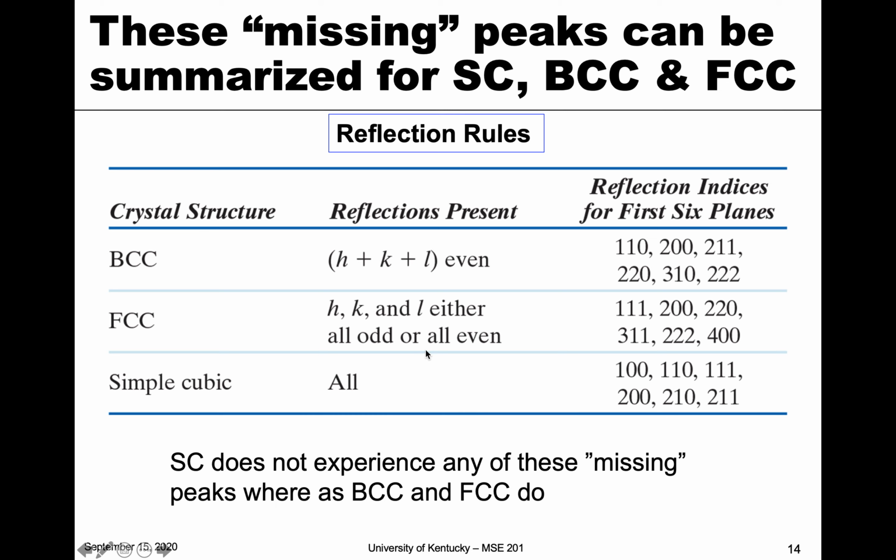Whereas simple cubic has all reflections possible. So it may seem like a bad thing, but this actually helps us differentiate the different structures based on what peaks are present.